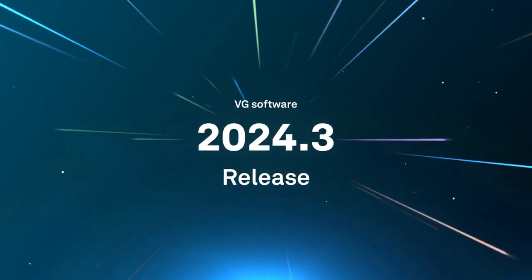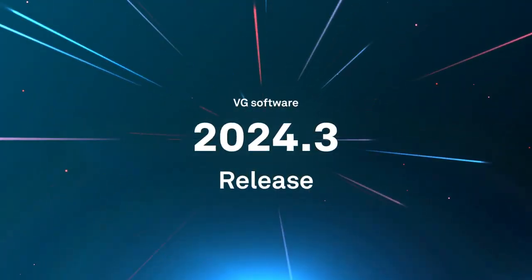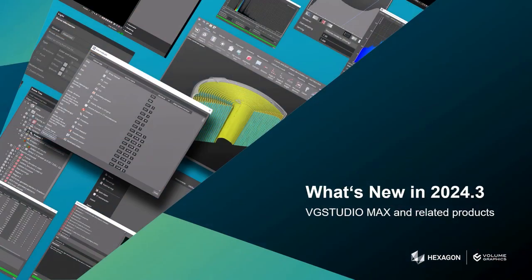Welcome to the What's New video for the 2024.3 release of VGSTUDIO MAX and related products. It is going to provide an overview of the new features available in this version, with a focus on how to actually find and use them in the software.